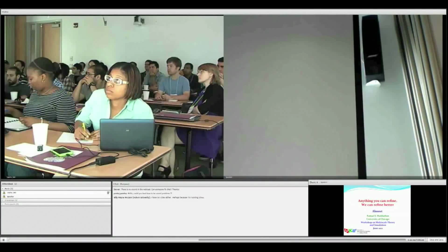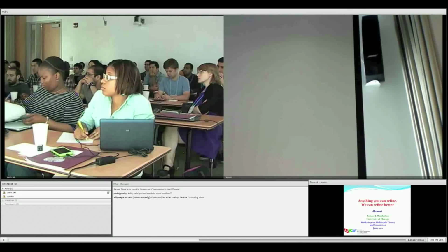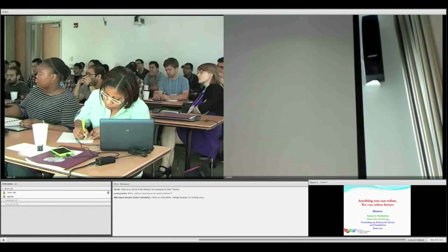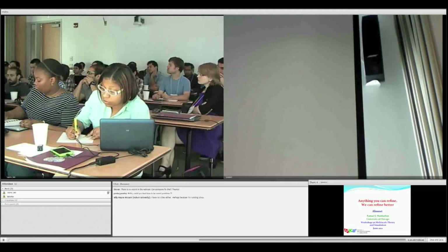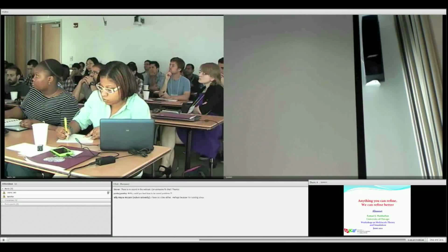Okay, good morning, everybody. Let's change the subject a little and go on to structure refinement. You already tried the server yesterday, and I assume by now most of you got the results back. So here I want to explain what is the background and what is the detail about this structure improvement.